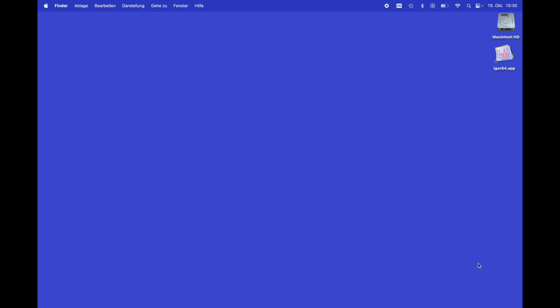Good afternoon. This is a beginner's tutorial to Igor Pro. Igor is a software for scientific data analysis and plotting. So what makes Igor different to other software?